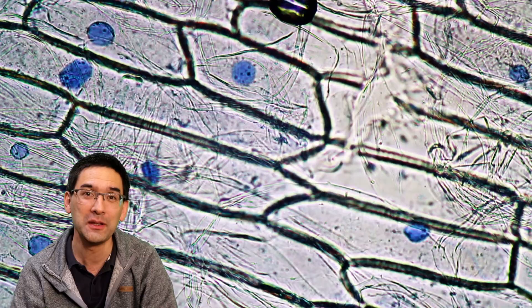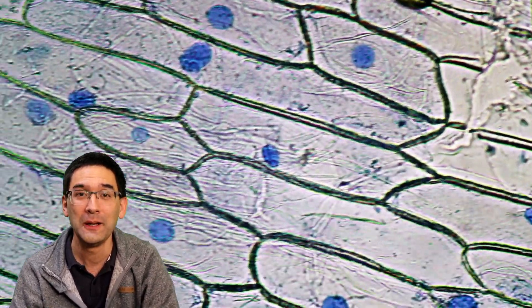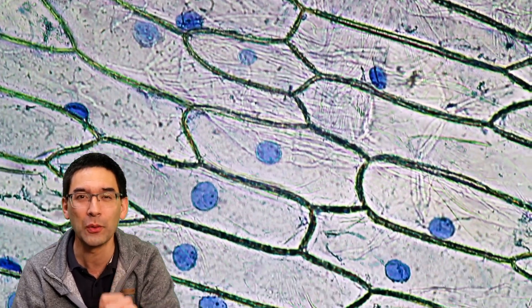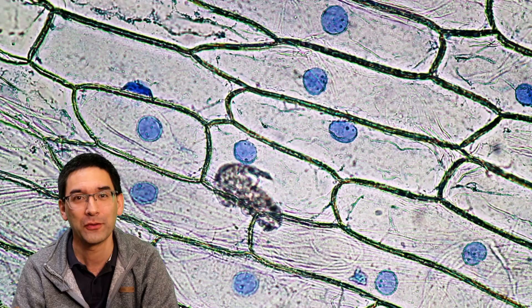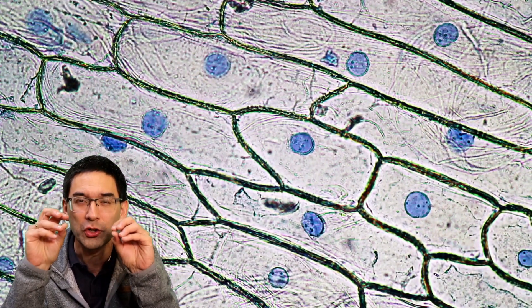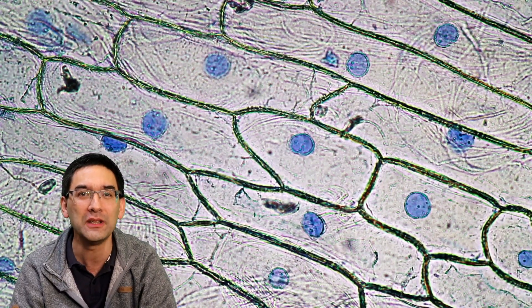I'll be zooming in a little bit more and we're going to have a look at several of these nuclei, because what I also want to show you is the so-called nucleoli inside the nucleus. I was always able to find two of them. Nucleoli are two structures which are a little bit darker stained and can be found in each nucleus.